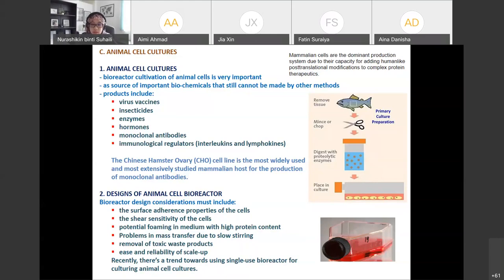You don't consume it, right? Humans don't consume it. It's just for treating the wastewater to reduce pollution. It's not as critical as therapeutic proteins, like those produced by animal cell cultures. Yeah. So that's why, single-use bioreactors are actually the idea and the motivation here. The creation of this variety is actually for animal cell cultures.